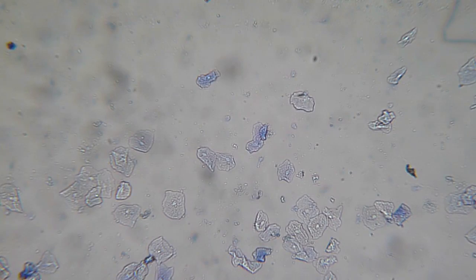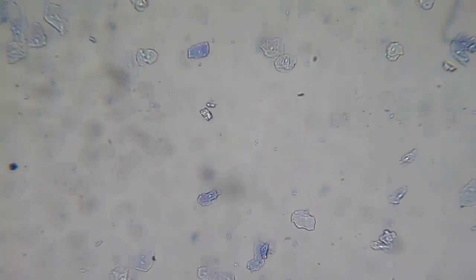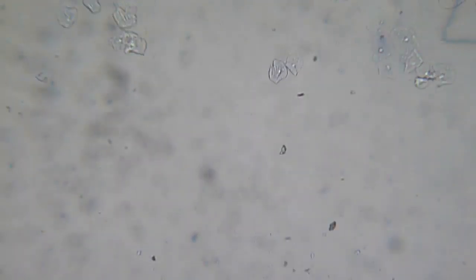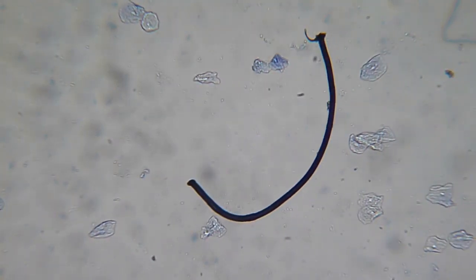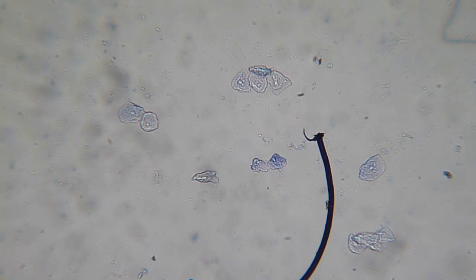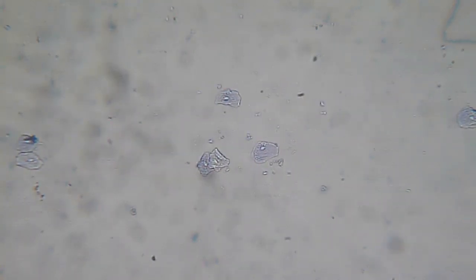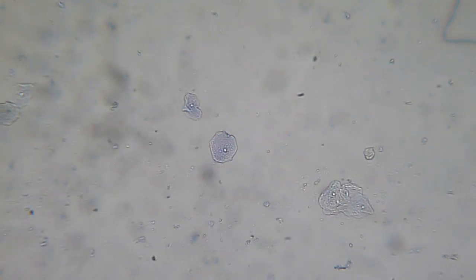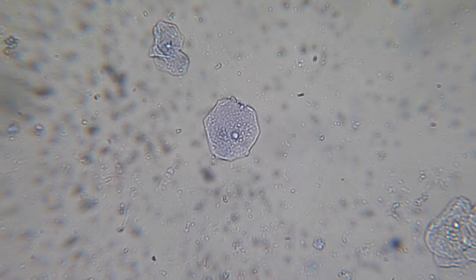I'm looking at the cells now at 100x. Not all of the cells have taken on the blue color very well — some cells are a little bit more blue than others. There's a black long structure that seems to be a cotton fiber from the q-tips. We see a lot of cells, but not all of them have taken on the blue color well. Let's try to find one which seems to work better. I'm looking at this without a cover glass — I just put the dry slide directly under the microscope. That's now the 20x objective, and you can see it's slightly blue, and you can see the nucleus in the middle. I'm going up further to 400x.